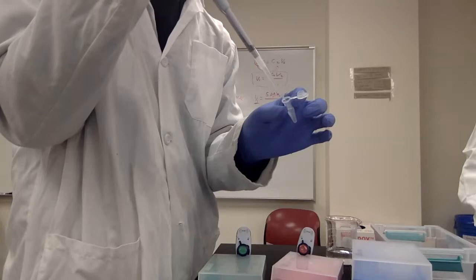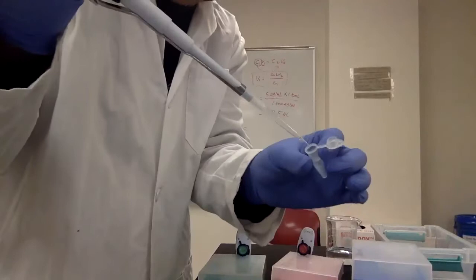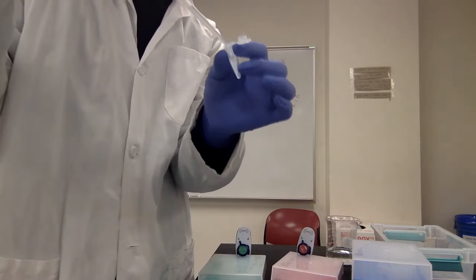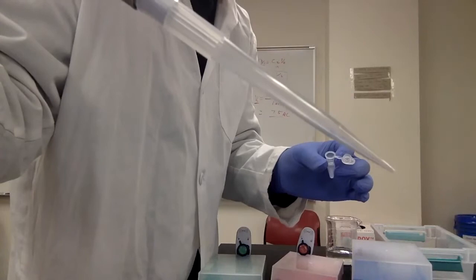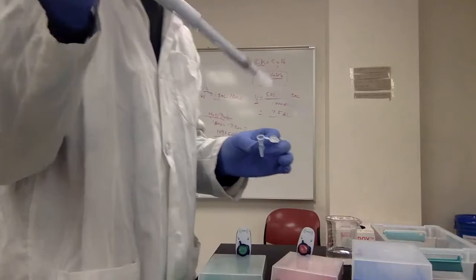first stop. As you can see here, I'm not sure if you guys can still see, there is still some water or liquid left in the tip. So that's why we need to push further, to the second stop, so you can get rid of all the liquid into the tube. If you look at the tip closely, there's no water left inside. So that's why we designed the second stop, so you can get all the liquid out of the tip.